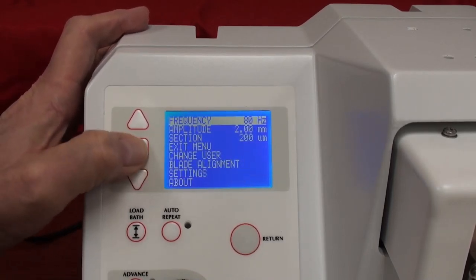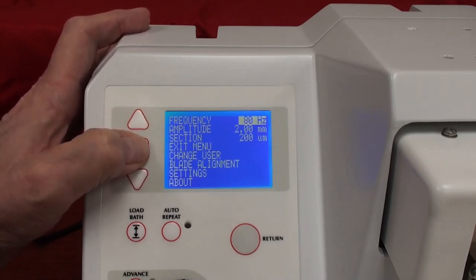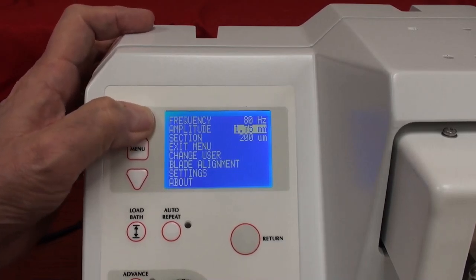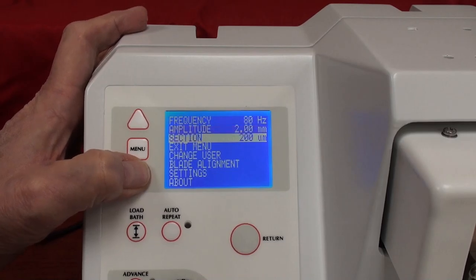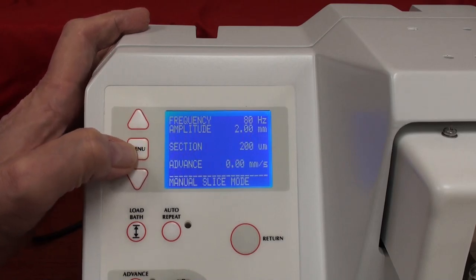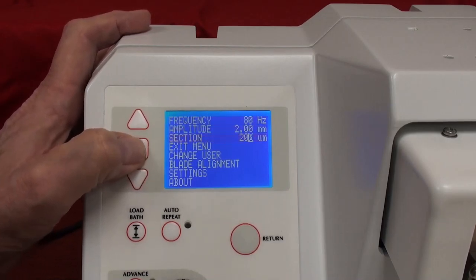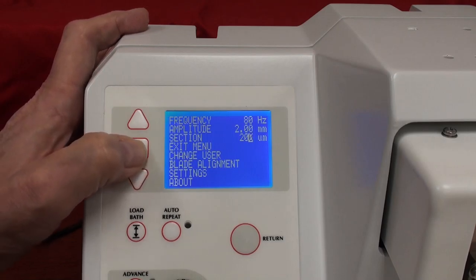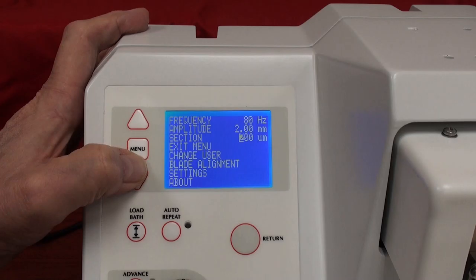Press menu once and it gives you the ability to change the frequency within the instrument's given range. Press menu again and you can change the amplitude up and down within a range — the manual has a chart showing a matrix of valid amplitude and frequency values. Here you can also increment the section thickness up and down, advancing through units of ones, tens, and hundreds of microns.